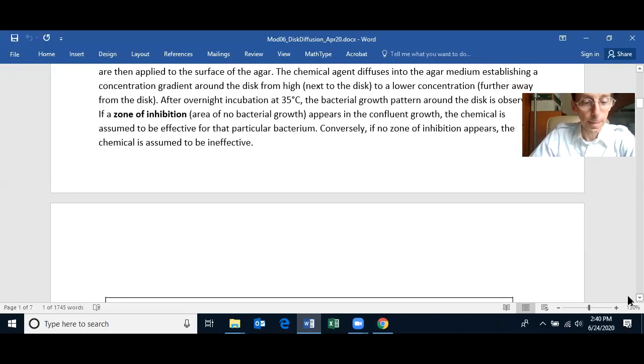I hope it's not too windy, but I was just thinking if it was an inhibitor that you would still have some that are working, where the ones that is more clear. So you're saying that the one that kills the cells will be a total clear zone of inhibition, and one that inhibits will not be totally clear. You'll see some haze in it. That's a good guess, but no, that's not the case. Because the bacteria are not visible to our eyes if they're not growing. Anyways, think about it, and it'll be one of the questions. I'll get back to you on that when we're answering the questions.